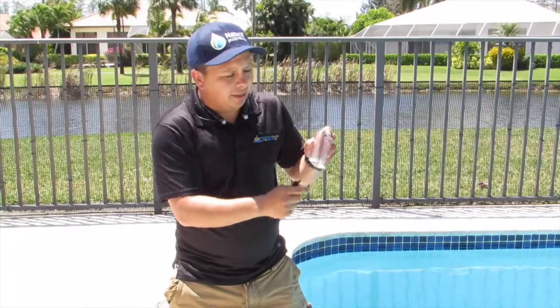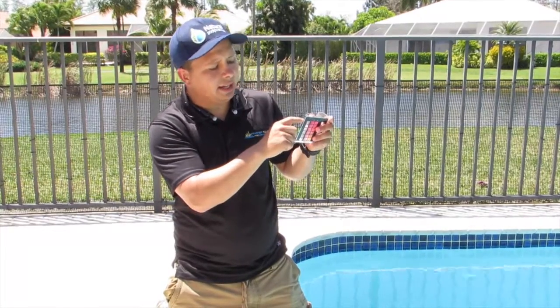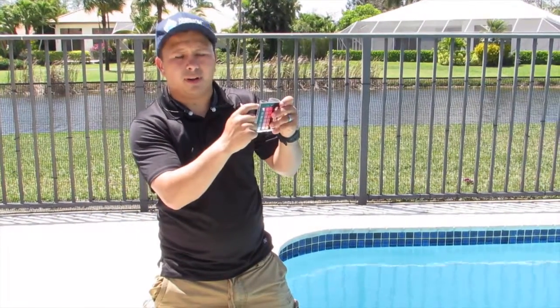You want to fill up the small bottle. It has a 9 on it, so you want to fill it up all the way to the top.